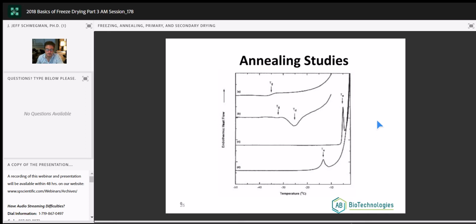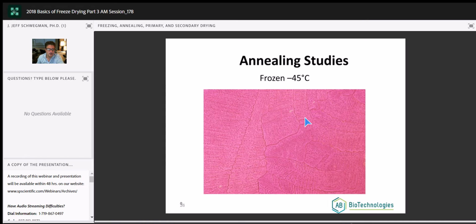What should I expect to see? Well, we shouldn't see a glass transition. We've converted the glass to a eutectic. I shouldn't see the crystallization. There's nothing to crystallize. All I should see now is this on that second ramp up, where we're melting the eutectic that we formed right here. Perfect, okay? We can also do this on annealing, or I'm sorry, on the microscope.